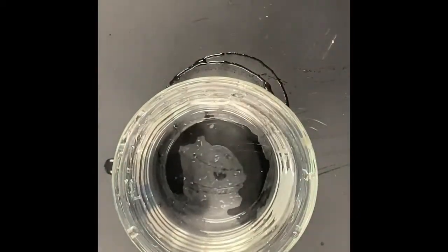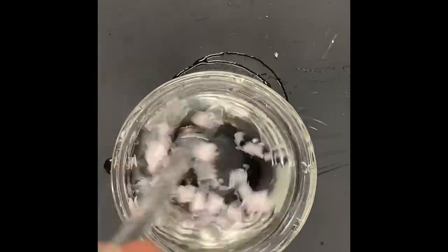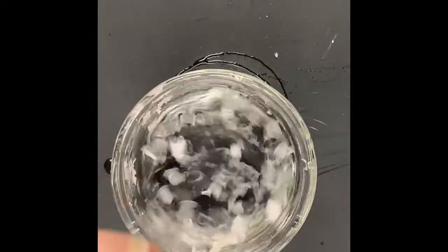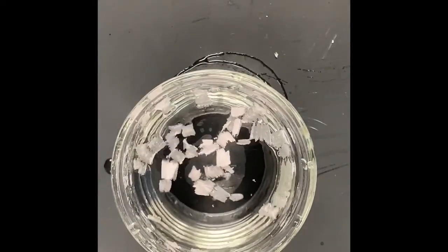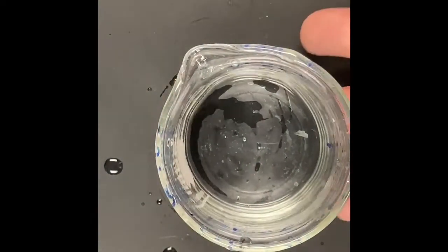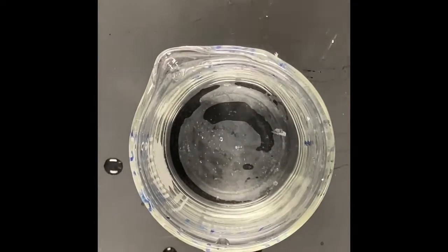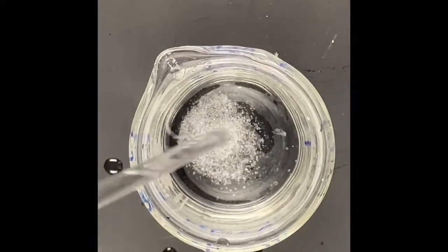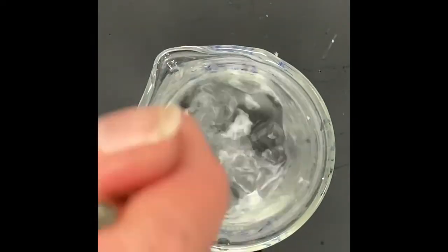Next is our paraffin wax. Okay, you guys, you can observe that and see what's happening there. As I take that away, I'm going to bring in another glass here so that we can put in sodium chloride. Some of you might even recognize what that looks like. And you can make your prediction as we're doing this.